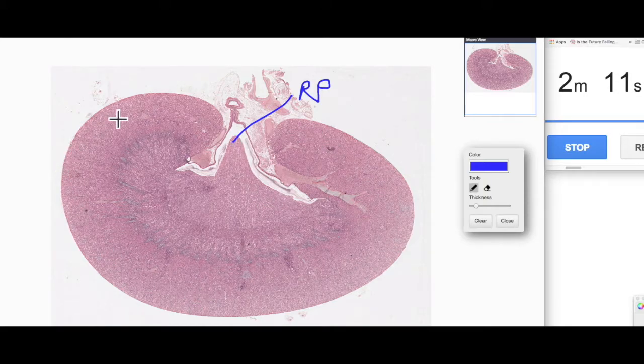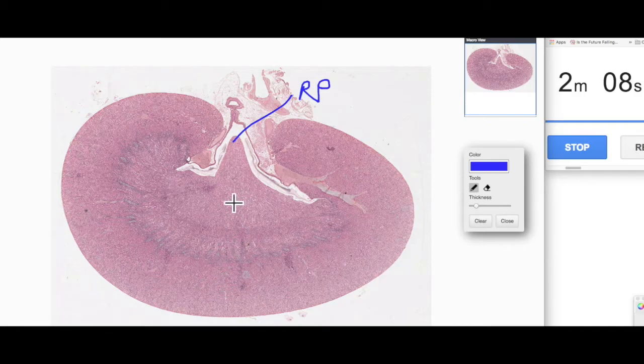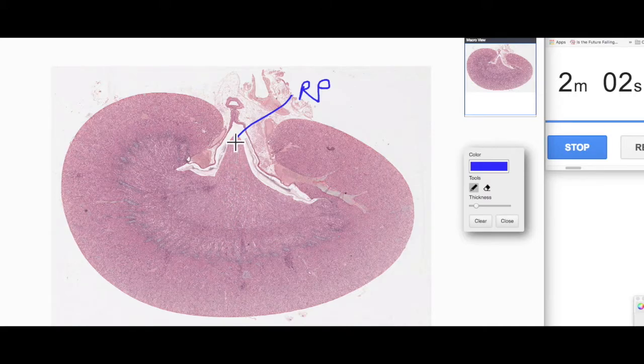The blood is filtered within the cortex, and then whatever doesn't get reabsorbed remains behind and goes on to form urine. It travels through the collecting ducts and eventually empties into this region here.